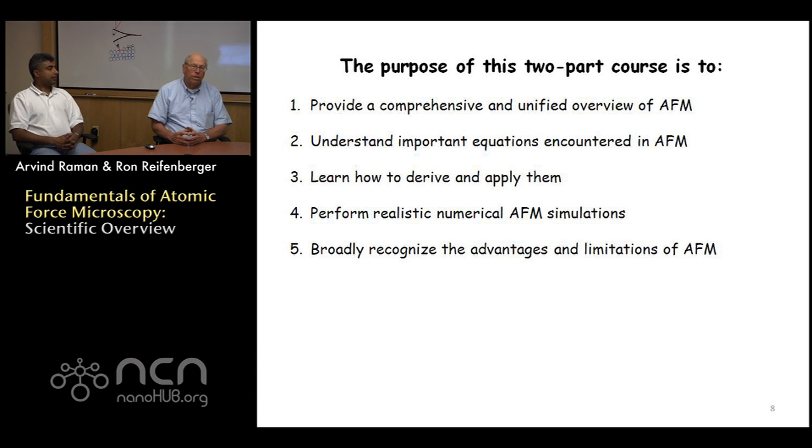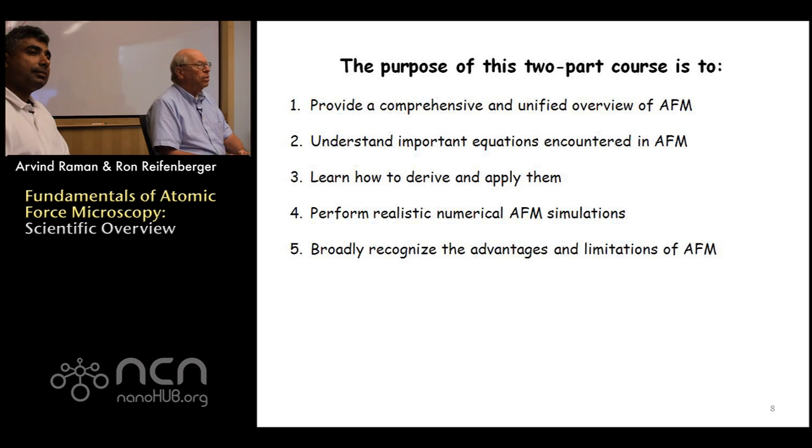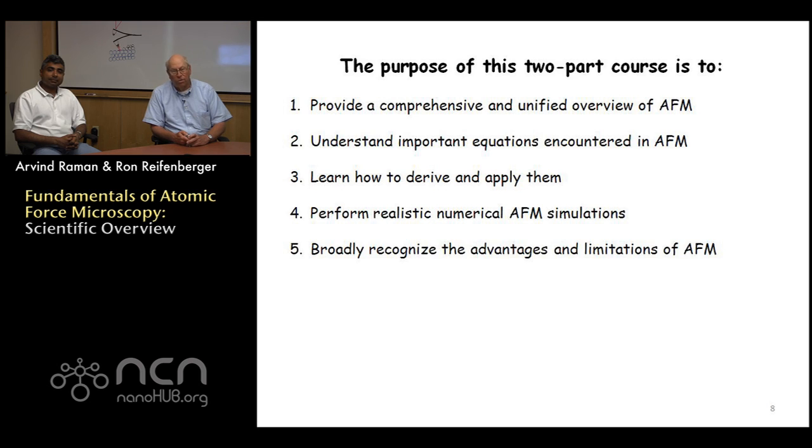So to summarize, the purpose of this 2-part course is to provide a comprehensive and unified overview of AFM. We'd like you to understand the important equations encountered in AFM, and we'd like you to learn how to derive and apply them correctly. We'd also like you to be able to perform realistic numerical simulations using the Veda software. And lastly, we'd hope that you would broadly recognize the advantages and limitations of AFM as you progress through your research.